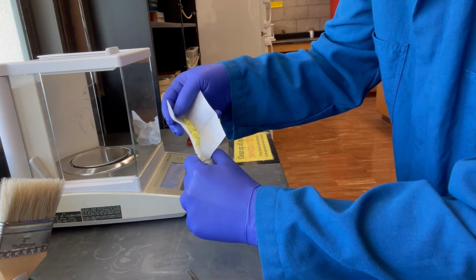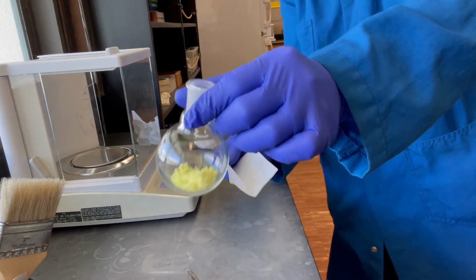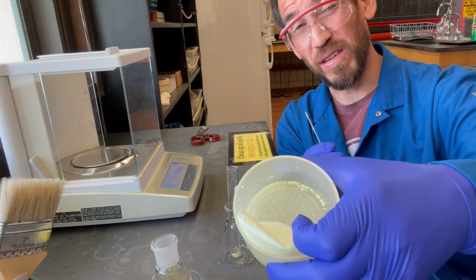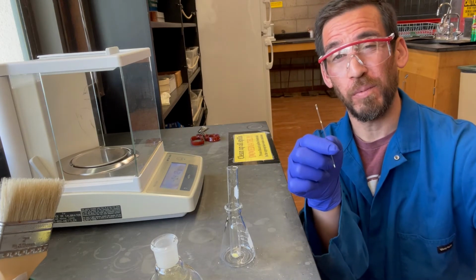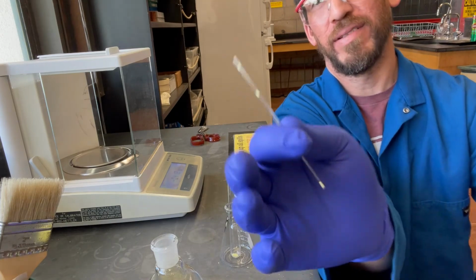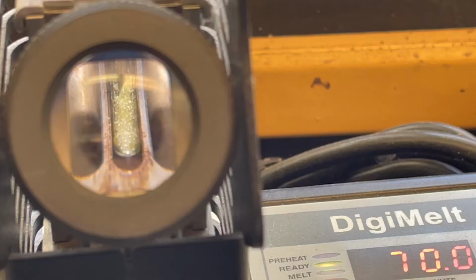All right. Look at that. You just learned today. So let's go take a melting point. Just wanted to let you know, I used the stuff that was left over in here to get my sample for my IR, my thin film, as well as my melting point. Think McFly, right? Just to conserve, so that way we know our actual mass that's in here for our calculations next reaction.